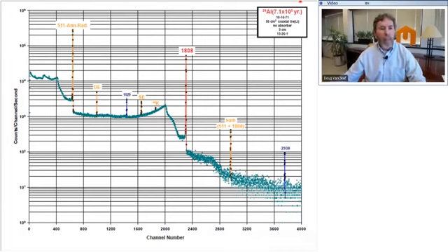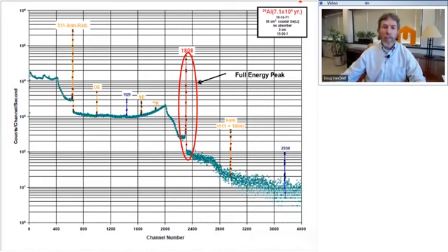If a gamma ray enters the detector and undergoes a series of Compton interactions, finally resulting in a photoelectric event, we get an observation in the full energy peak region. When a gamma ray enters the detector and undergoes one Compton interaction and then leaves, there is a maximum amount of energy that can be deposited. That maximum energy deposition occurs when the gamma is scattered near 180 degrees. This physics principle results in a spectral feature called the Compton edge.